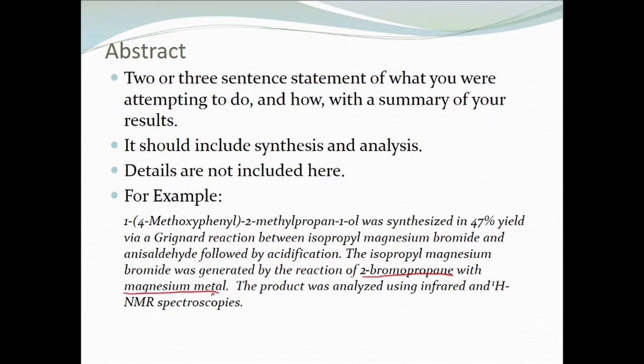And so in your case you would name the specific alcohol and the fact that you're using sulfuric acid and sodium bromide for the nucleophile. Again, specifically, name your reactants, name the product, and name the reaction type that you are using.